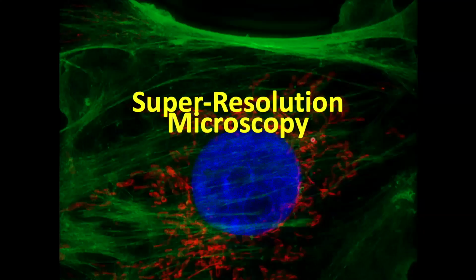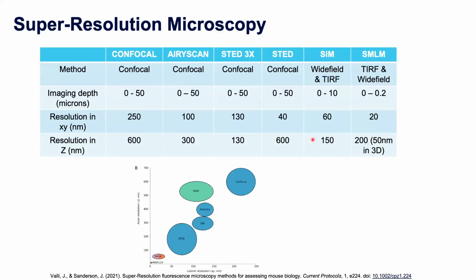Okay, so that's molecular imaging. What we'll do over the next few slides is go through some super resolution microscopy applications. And I've put together a table here which identifies some of the more common ones.